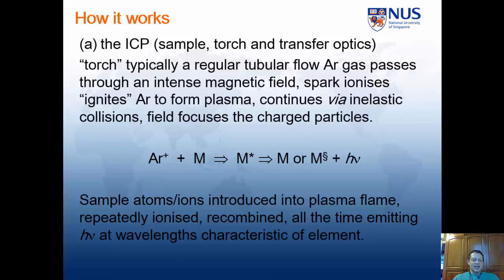Now, clearly, those wavelengths are characteristic of the element. There are a number of different excited state destinations for your ground state electrons. Therefore, you have a number of lines in your atomic spectra.